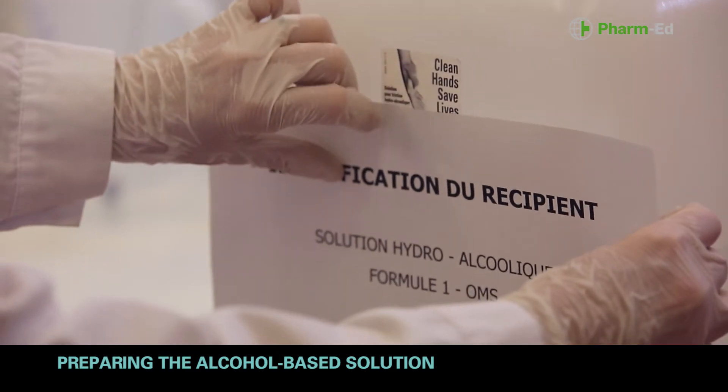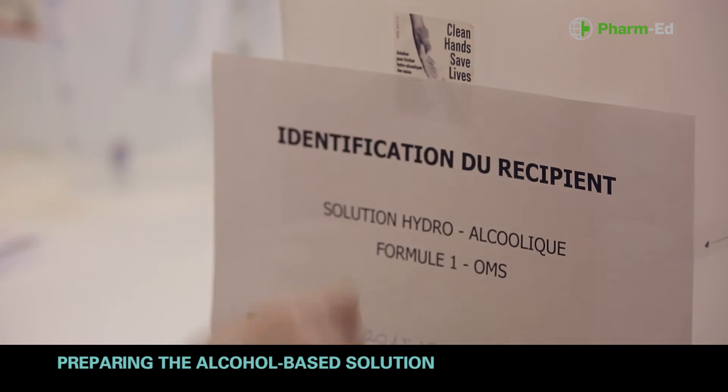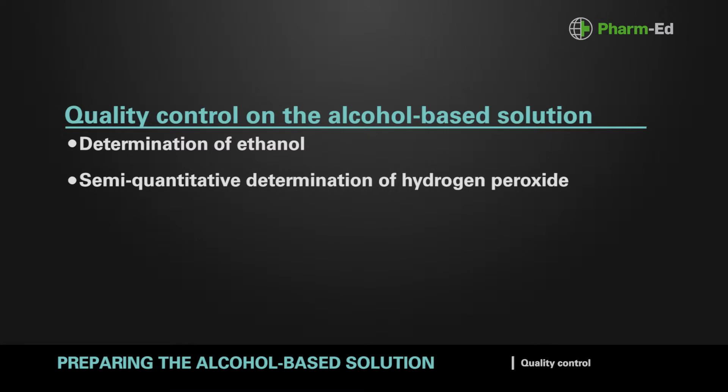Label the container with the name of the institution, the name of the product, the batch number and the date of production. Perform quality control on the alcohol-based solution before placing it in individual bottles.